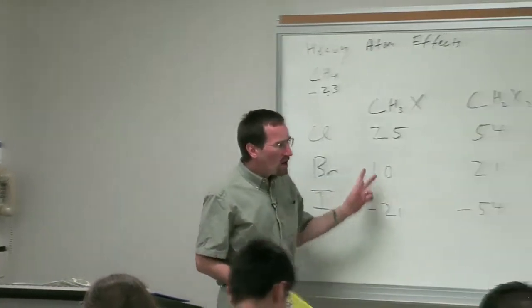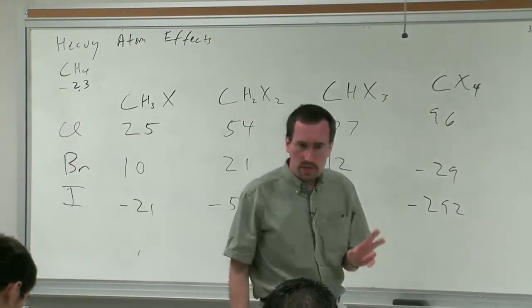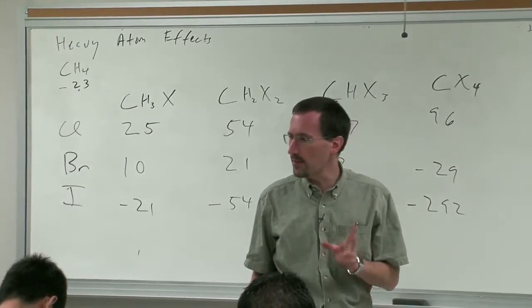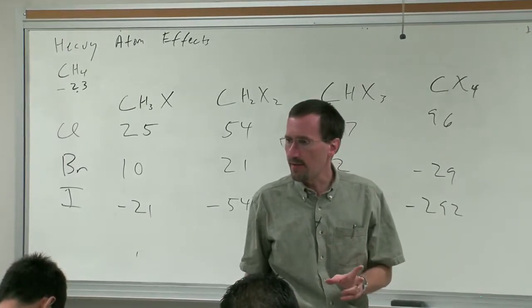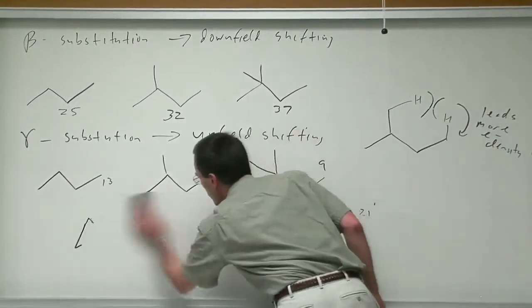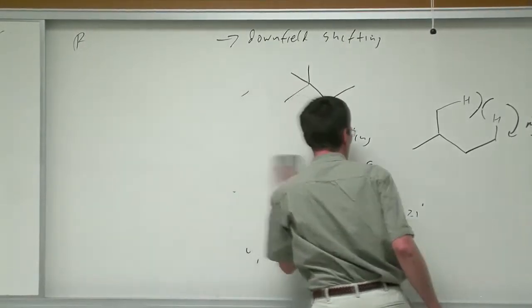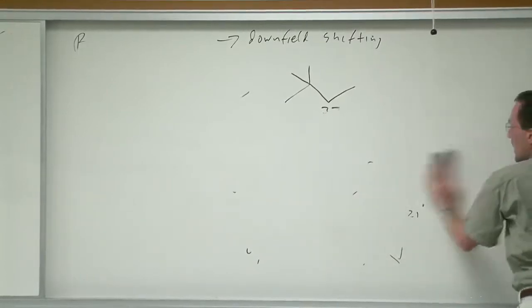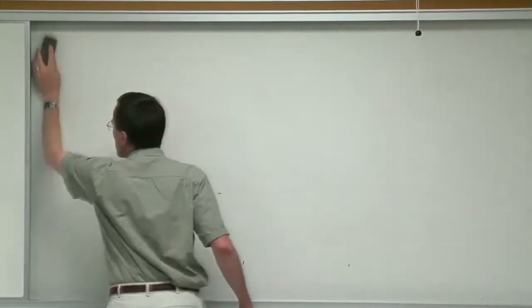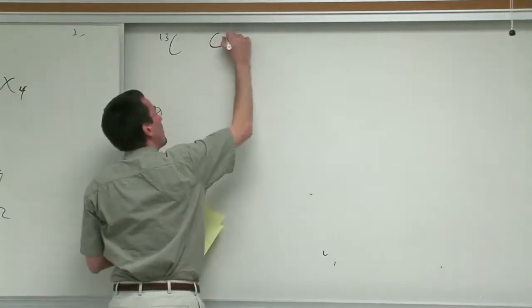All right, so one of the take-home messages from this is there are a lot of factors that go into carbon-13 chemical shift. And for this reason, carbon-13 chemical shifts are very rich and very valuable. And being able to predict them can lead you to lots of useful information on structure that can be extracted, that sometimes can give you a problem-solving tool that you might not otherwise have. And so what I'd like to do now is to show you some of these problem-solving tools and their applications. So we'll talk a little bit now about C13 chemical shift prediction.